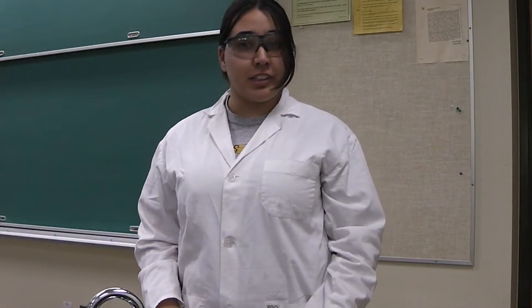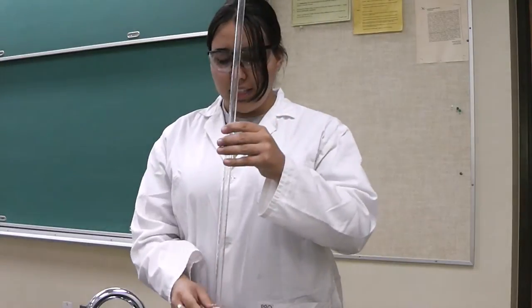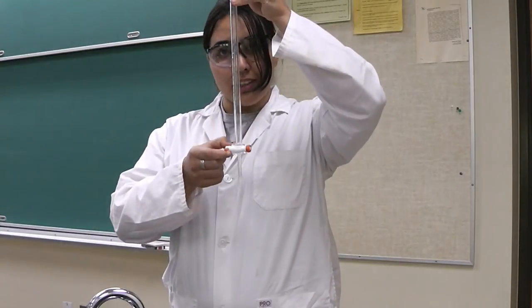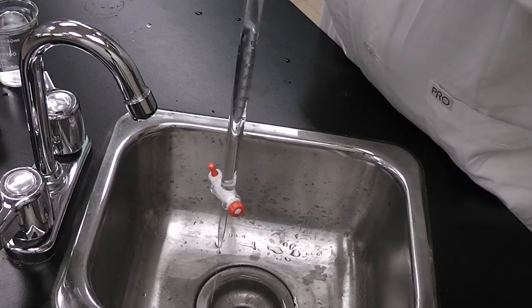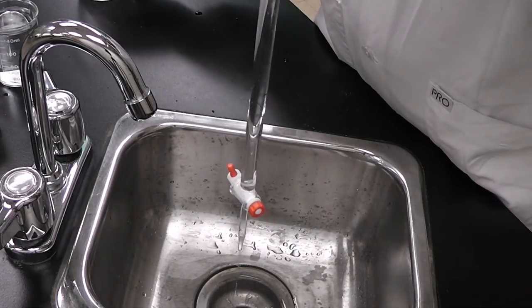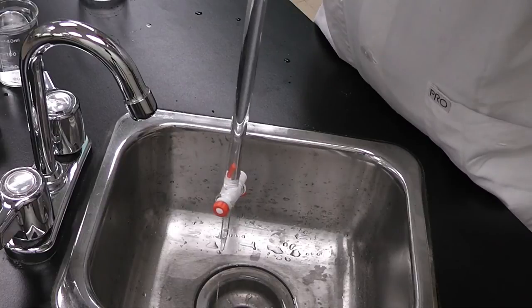The first thing you're going to want to do is to rinse your burette. Simply take your burette, open the stopcock, and pour in some hot water until it's about a third full.